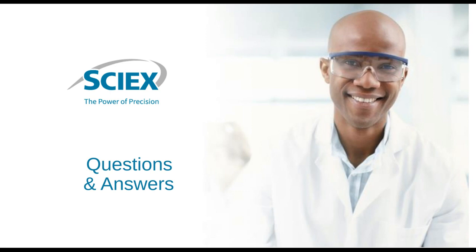Ooh, Pat, do you want to answer or shall I? Probably best for you, Steve, really, because I've not had that much experience of this yet. Yeah. Regarding our influenza proteins, the separation efficiency is absolutely fine. It's good resolution, but again, it probably depends on your analyte, really. And regarding sensitivity, I guess, Steve, have you got more ideas about sensitivity?